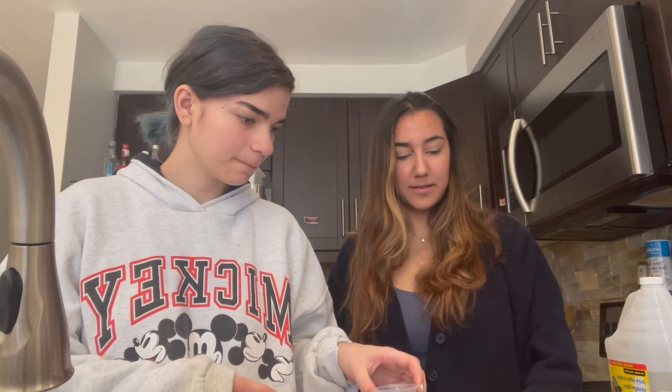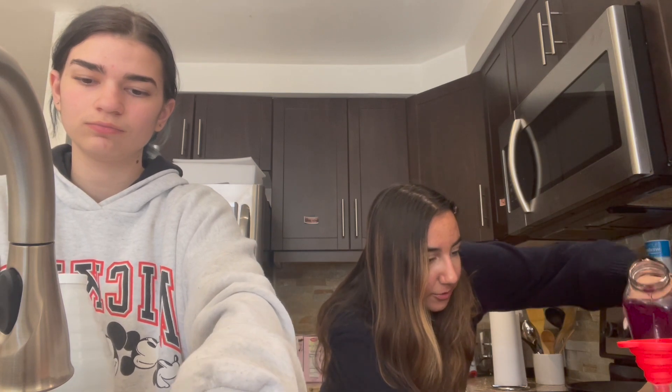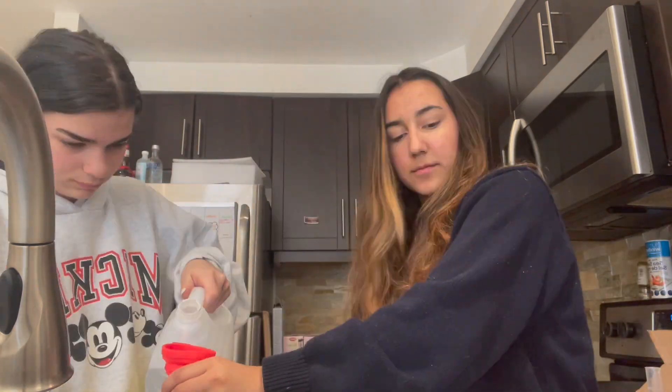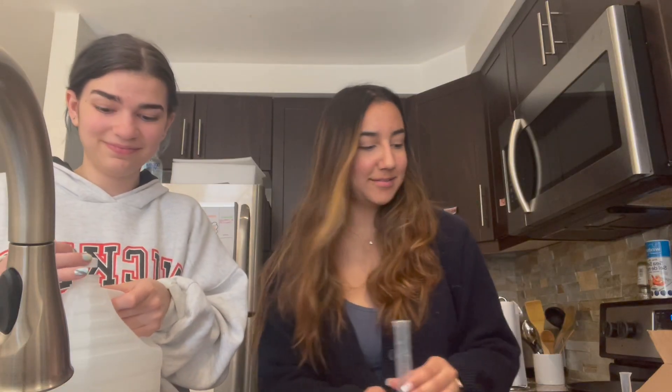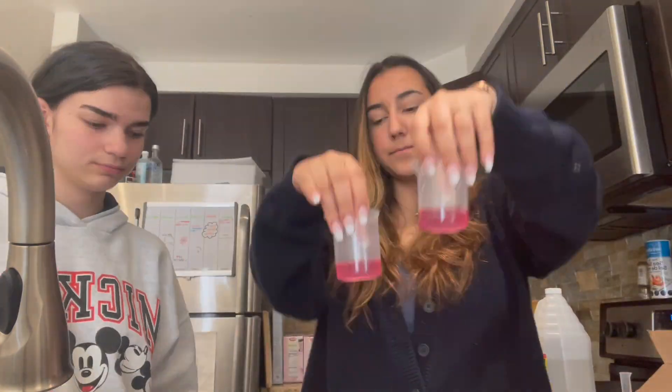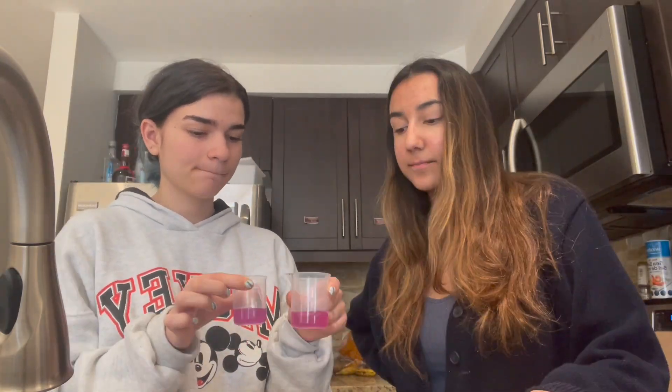We have to do this three times. We did not need this much cabbage juice. Here we're just preparing our next two trials. This is called not cheating, but cheating a little bit. By this point we're done our three trials, just ironing out our data. When I say cheating I don't mean cheating — I just mean making sure that our data is right and adjusting the numbers if necessary, but for this lab we didn't need to. And that's the end of our lab. Now we're just going to wash everything and then come back to you when we're doing our quiz and assignment.